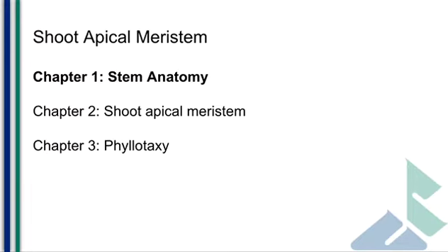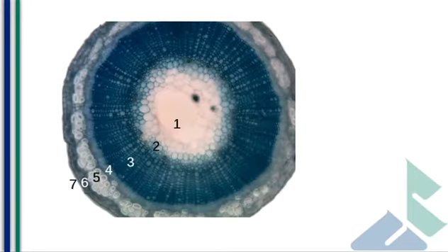So, first, let's take a look at this image from Wikipedia, where we see a flax stem in cross-section. I want to start here as this is a bit of stem that's kind of difficult to obtain, but very, very important. It shows the development of tissue as the flax stem is growing. This plant is not yet done, so it is not fully mature. But we see all of the elements in this eudicot or dicot.